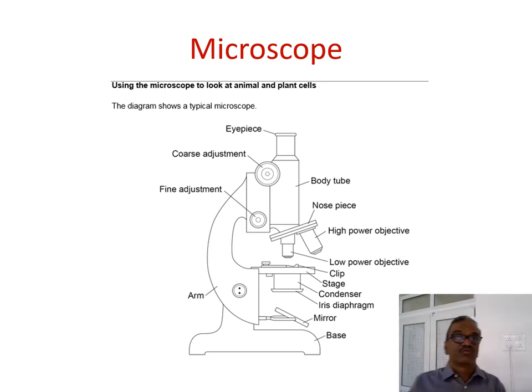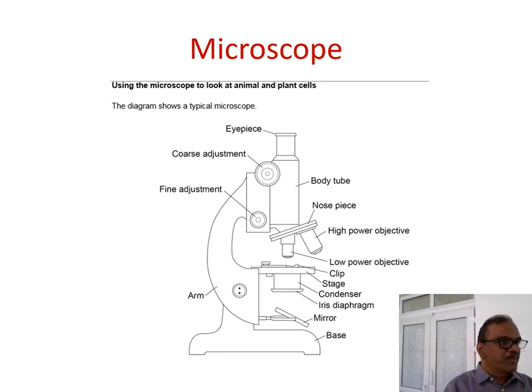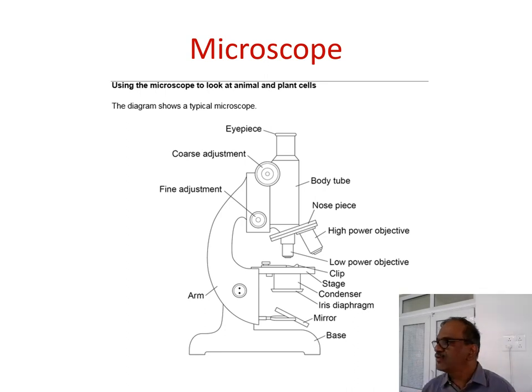But later they thought it was not enough, because Antony van Leeuwenhoek himself said 200x magnification is possible. In that case, another lens has to be used. Here, 10x and another 10x gives you 100x magnification. With an eyepiece of 10x and an objective of 20x, you get 200x magnification. So how best can we increase the magnification with the help of many lenses? In a compound, so it is called a compound microscope. Some call it a simple compound microscope, but it is a misnomer. You can call it a compound microscope with two lenses instead of a single lens: one is the eyepiece, another is the objective.